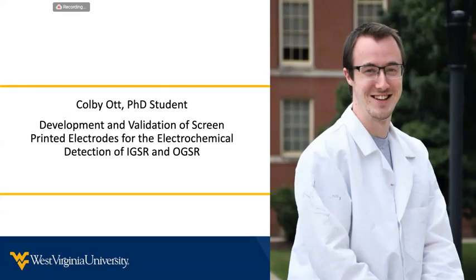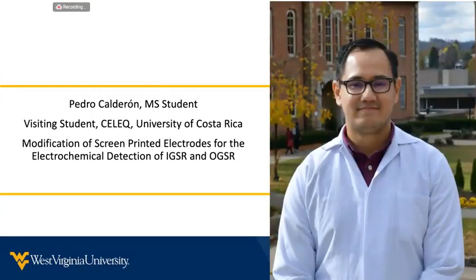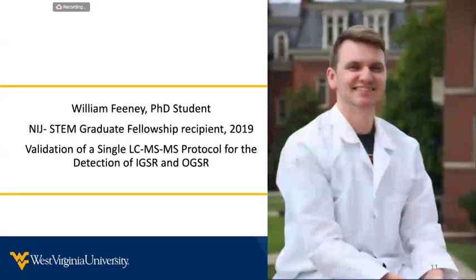gunshot residues. Pedro Calderon is a master's student, he's a visiting student from the University of Costa Rica, and he is helping us with the modification of screen printing electrodes with nanoparticles for improvement of the detection of gunshot residues.